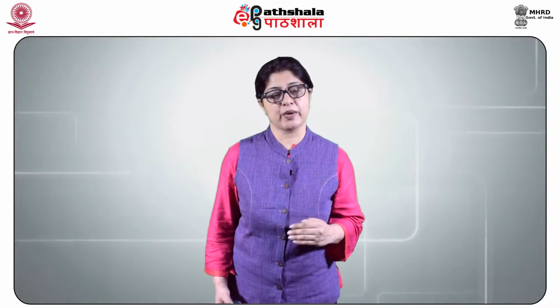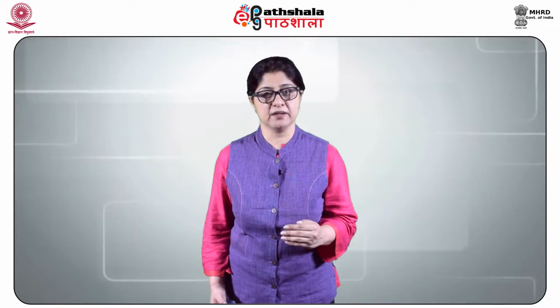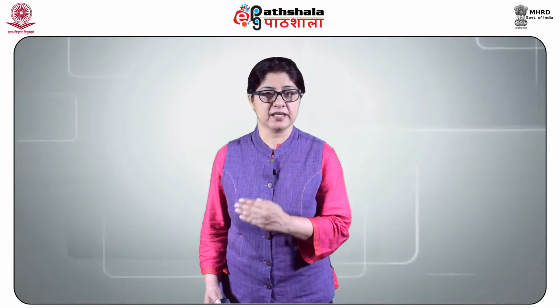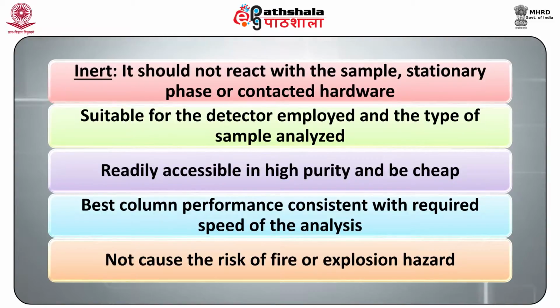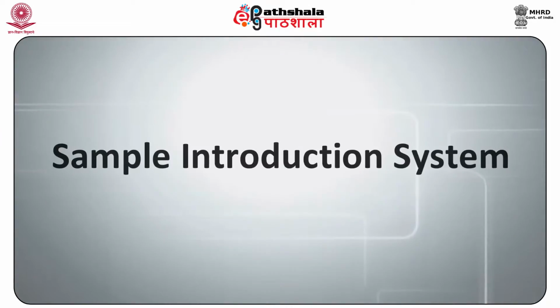A carrier gas is required in a GC system to flow through the injector and push the gaseous constituents of the sample into the GC column, which leads to the detector. For selecting a carrier gas, the following considerations should be taken into account. Firstly, the carrier gas should be inert, in other words, it should not react with the sample, stationary phase or contacted hardware. It should be suitable for the detector employed and the type of sample analyzed. It should be readily accessible in high purity and should be cheap. It should give the best column performance consistent with the required speed of analysis and not cause the risk of fire or explosion hazards.